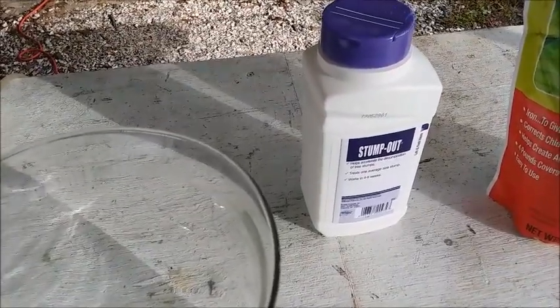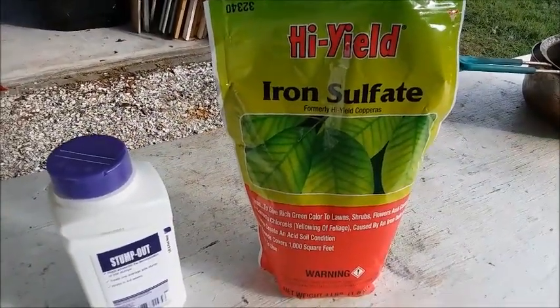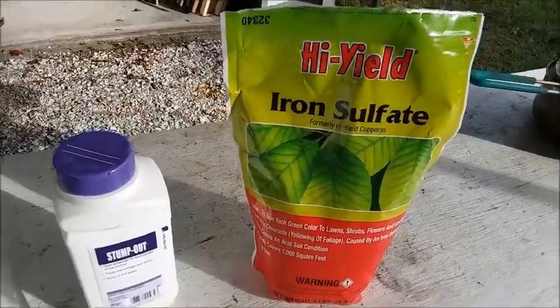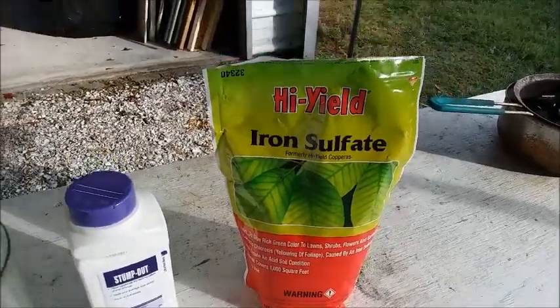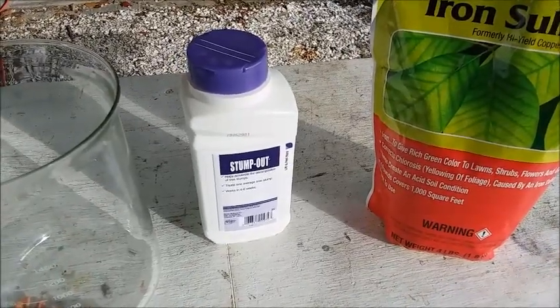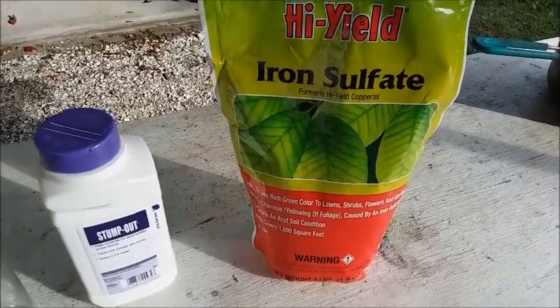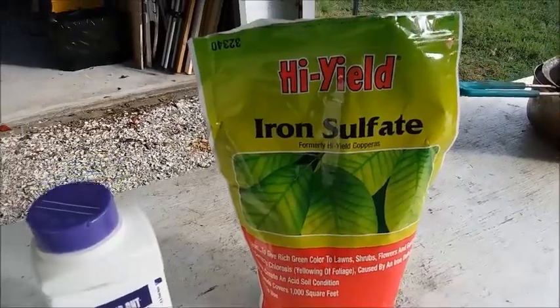So this time I dissolved and re-precipitated the gold twice with sodium metabisulfite from Stump Out like I always do, and for the third time I used iron sulfate — or 'copperas' as it's generally called in the refining community. I've read that sodium metabisulfite can precipitate out platinum group metals as well as gold, but that iron sulfate will not. That's why I did the third precipitation using iron sulfate.